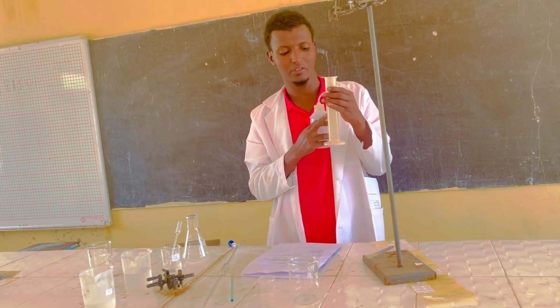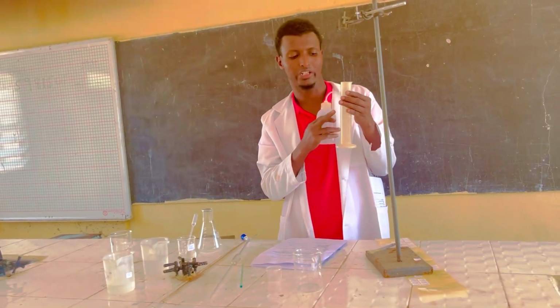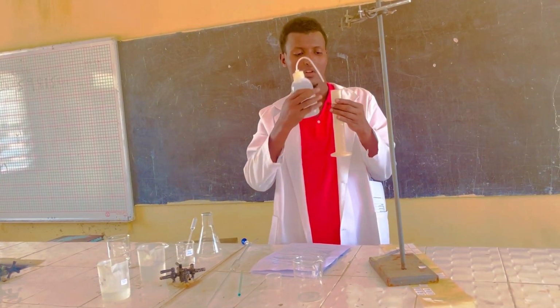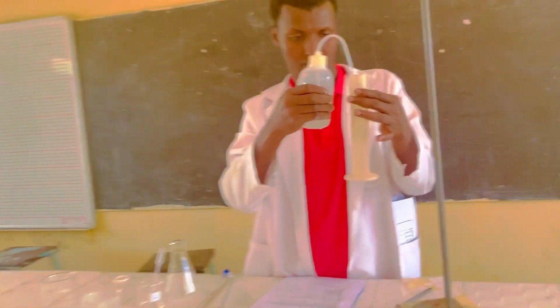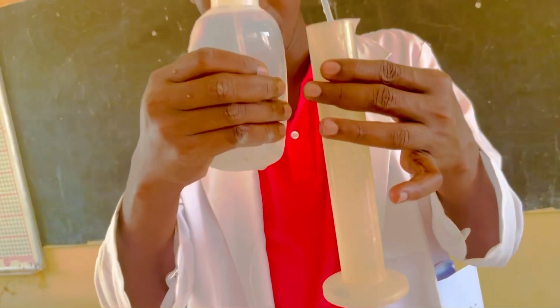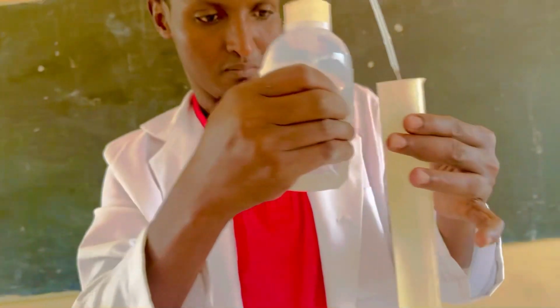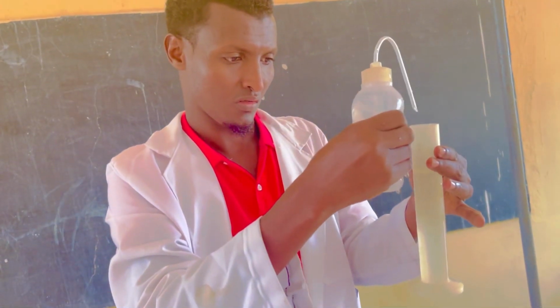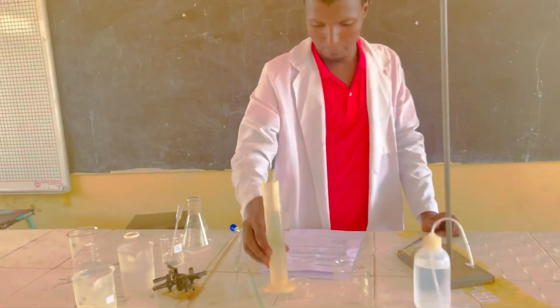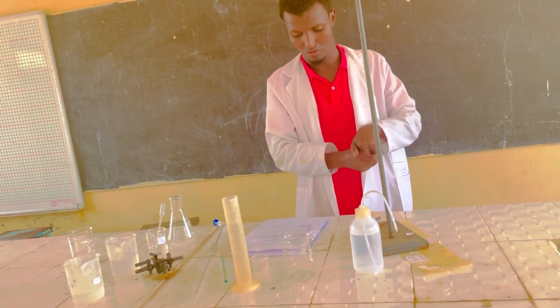So now there is that mixture. Now I'm topping up to 100 cm³ in a measuring cylinder of 100 ml. Now I have topped up to make 100 cm³ of the solution.